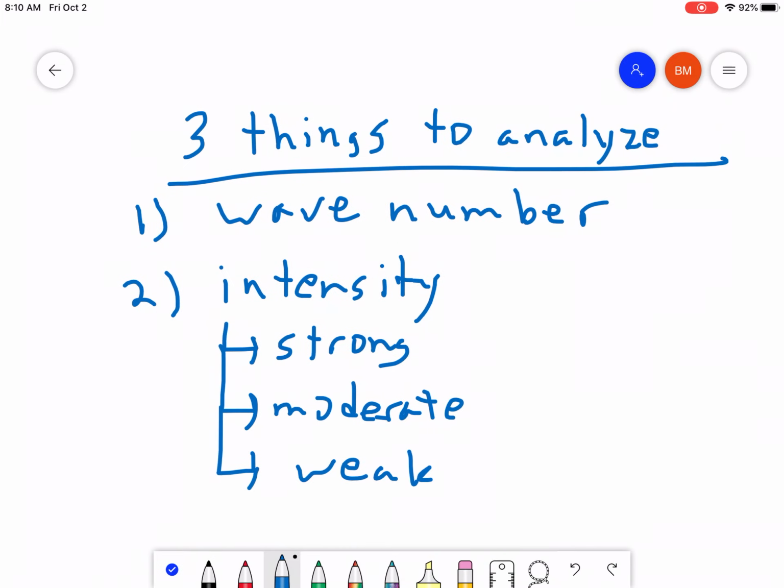And unfortunately, and this is common, different sources, like different correlation tables and other sources, will sort of define these a little bit differently from source to source. If you have one that's on the borderline, one source might call it strong and the other one might call it moderate. And then there are other sources that have conglomerations. So you might have moderate strong or moderate weak, right? Here's a good general guideline that I use.